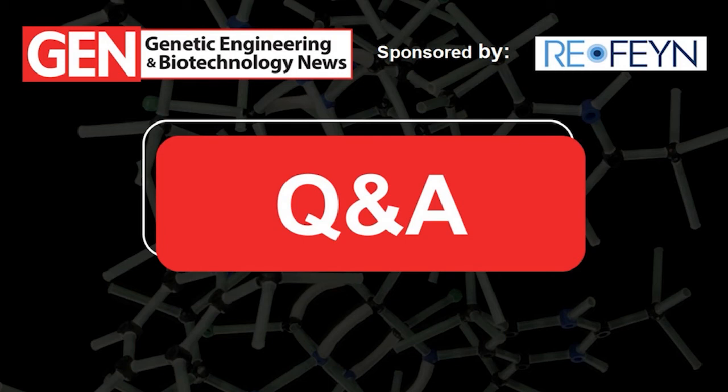All right. And another audience member would like to know, what was the purity of the preps in comparison with cryo-EM? As I mentioned earlier, these were prepped in the same way for the benchmark comparison. We have also tried different purification stages. The power of mass photometry is also a bit what lets it down sometimes, is that we see every single protein.